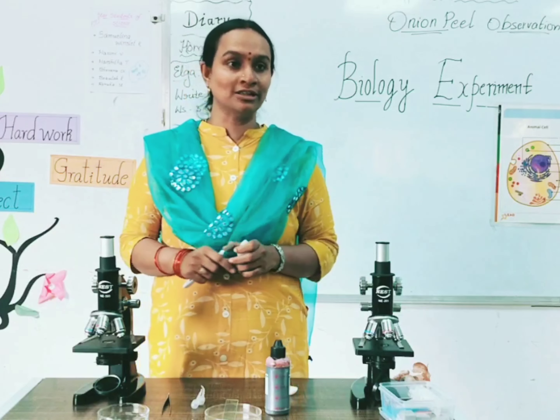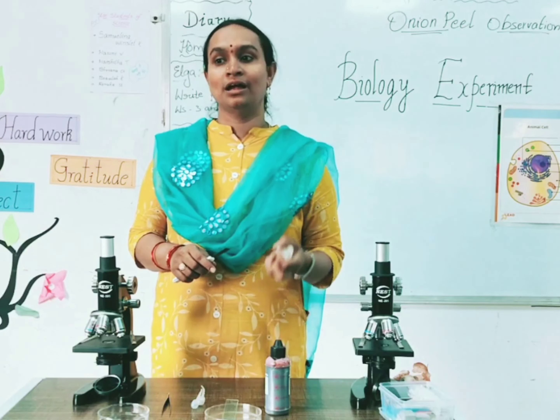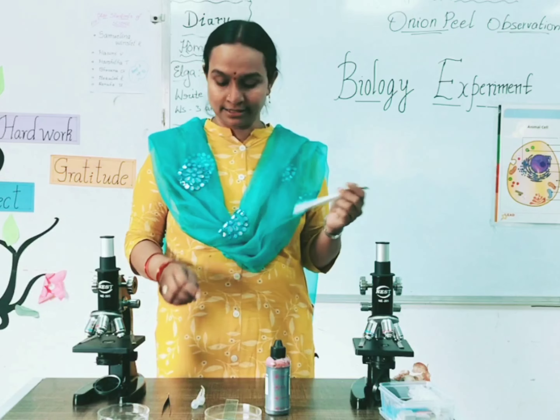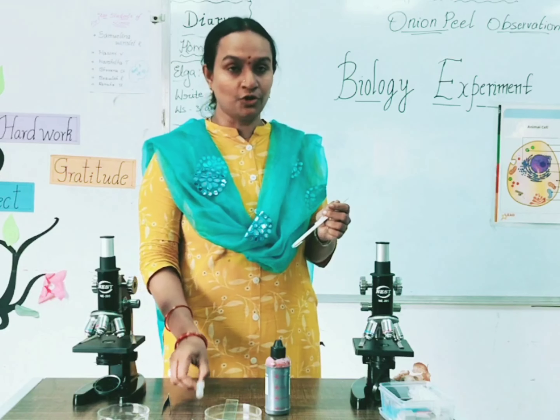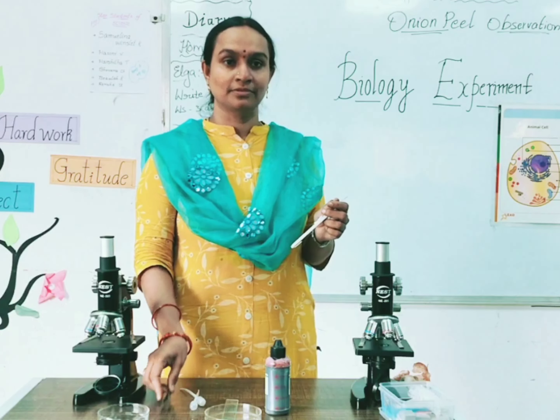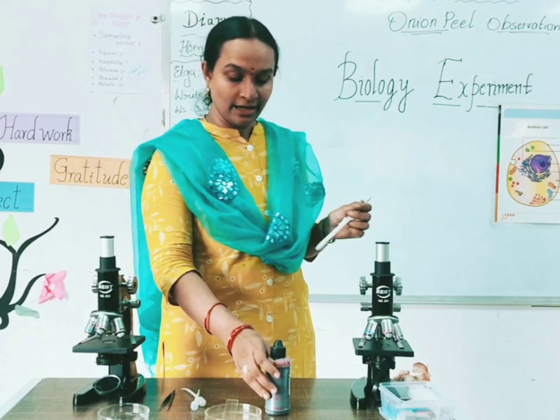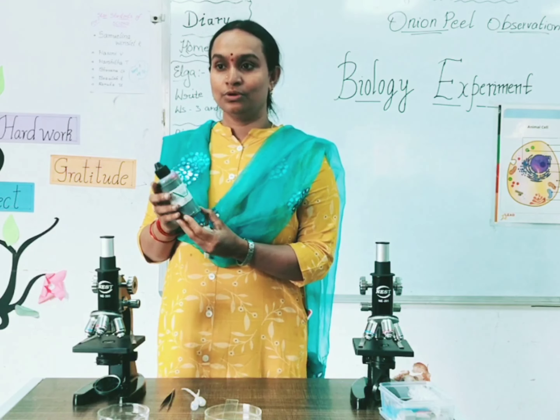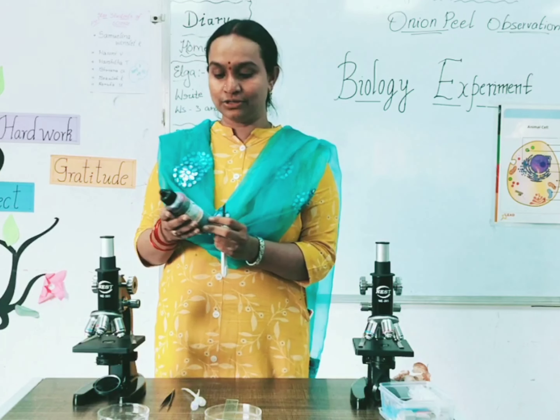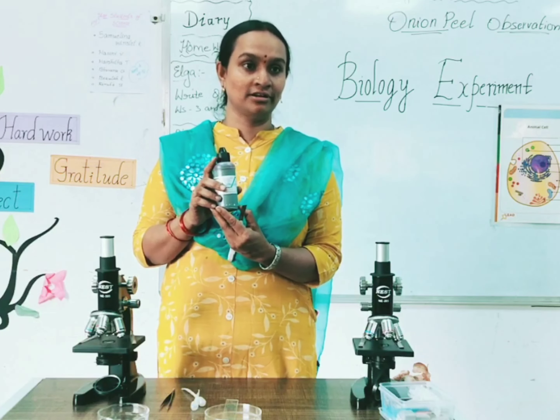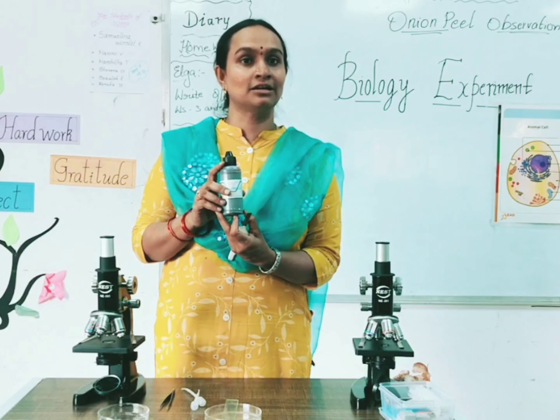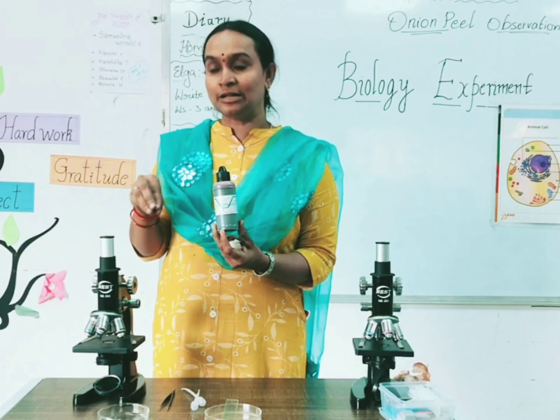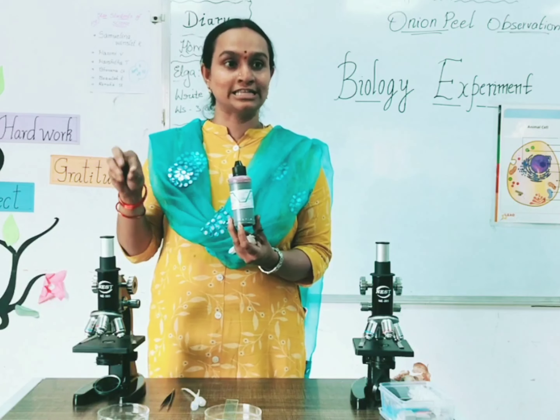So for that, what are the materials required? We require an onion, a microscope, a cutter, dropper, forceps, and a color. We add a color to this — that is safranin solution. We add this color to see the onion peels clearly. That helps us to identify the cells clearly.